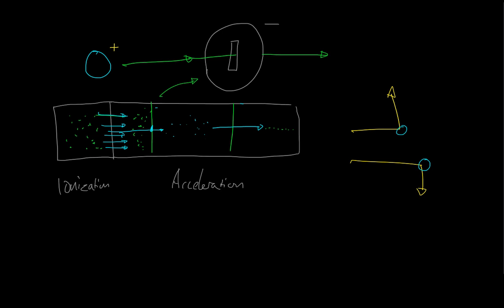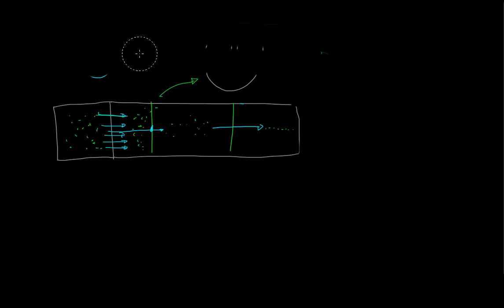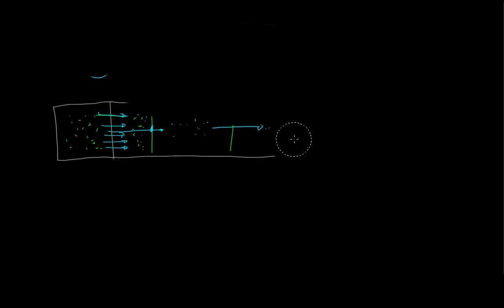So there. Now let's think about the deflection bit. Let me just rub out this again, or I will run out of space and that won't be pleasant for anyone. Okay, the deflection bit. So we have a finely focused beam of ions travelling down this tube that I've drawn here. This is the direction that they're going. These are positive ions.